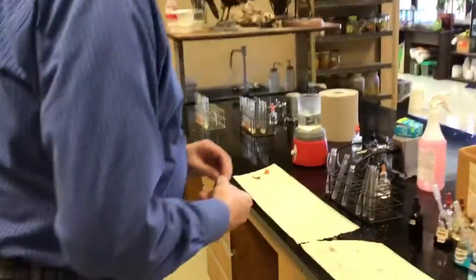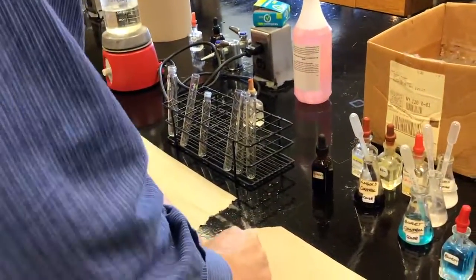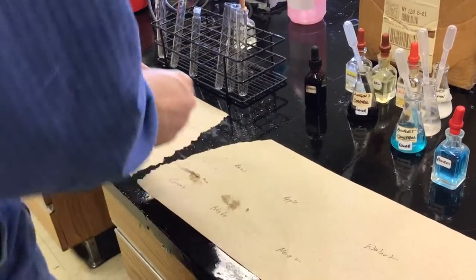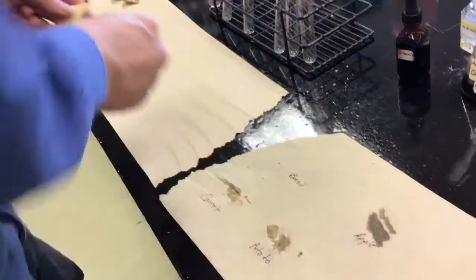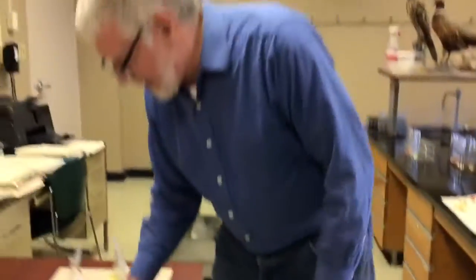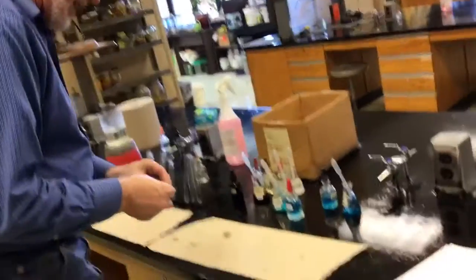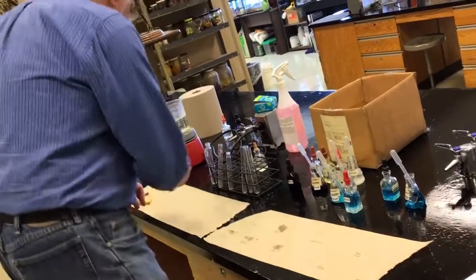Potatoes you have to be careful with, because it's pretty easy to make a wet spot with the potatoes. You don't want a wet spot so big that it takes forever to dry out. So I'm gonna move the potatoes over here. Same thing's true for the apple. I'm gonna crack the apple, get myself a nice wet edge, make some wet spots with the apple. Move the apple over here. The meat, this is ground beef. I tried to get the least lean ground beef I could get at the store. That turns out not to be easy anymore. And that I can actually make a pretty decent wet spot with. Move that over here.